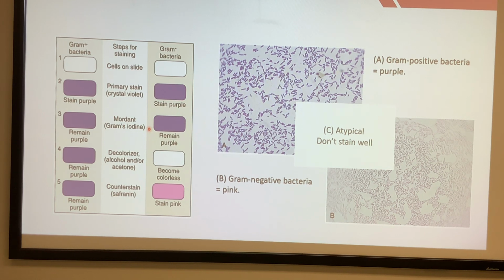Okay, so direct observation is normally done through a gram stain, okay? Unless you're certain it's something else, not a bacterial infection, then you may do another stain. But like 99% of the staining in the clinical lab is gram stain. Gram stain, how do you do that? Just a little bit of introduction.